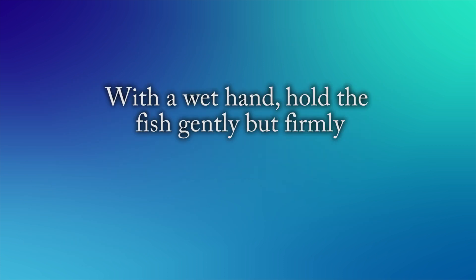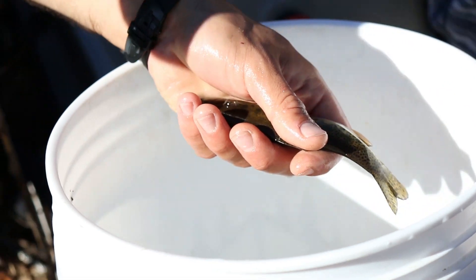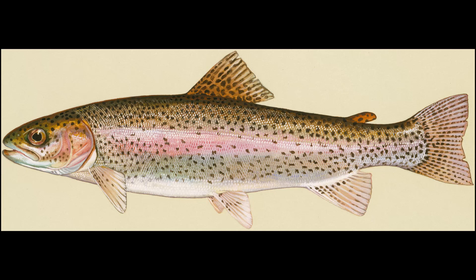With a wet hand, hold the fish gently but firmly. You should have a firm enough grip to ensure that the fish does not slip, but gentle enough that the fish is not harmed. Carefully spread the anal fin out across your hand. It is easier to hold the scissors steadily when the fin is resting flat. The anal fin is located on the bottom side of the fish in front of the tail fin.